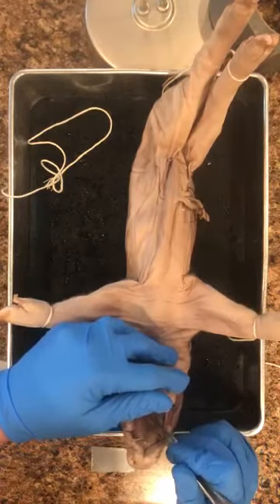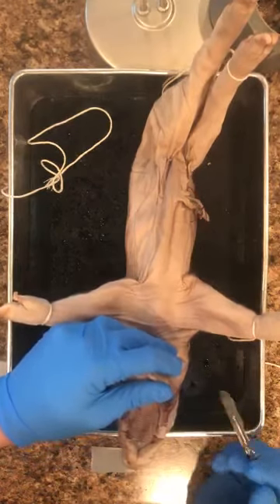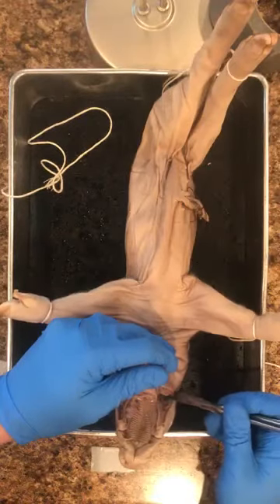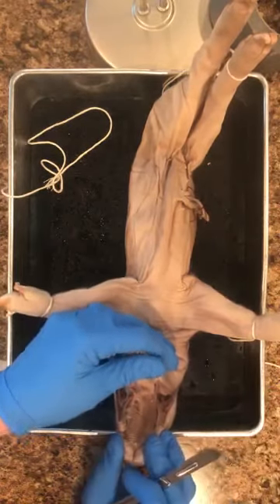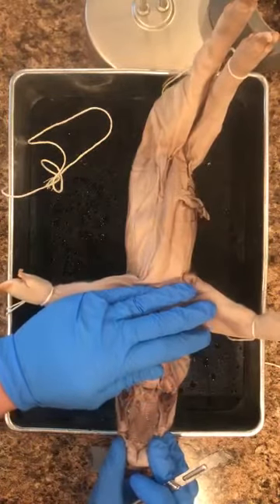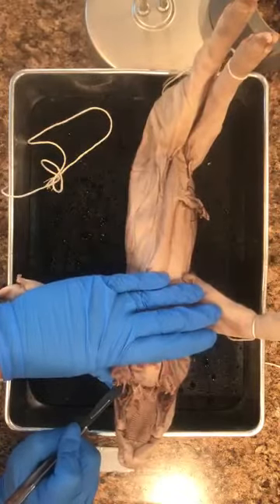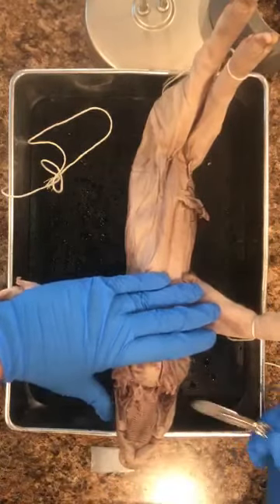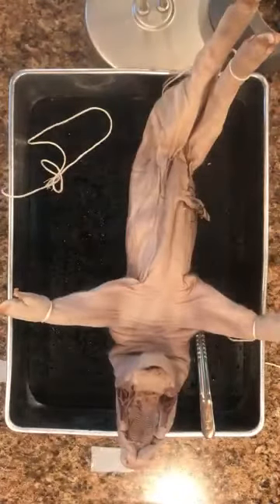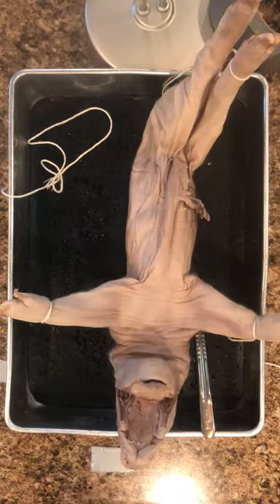I want you to be able to see everything in here. This burger has some sharp teeth. Okay. Awesome. Okay, so cool, guys. There's something I particularly need you to see here. So, I'm gonna get a paper towel and wipe some of this out. It's just like preservatives and stuff, gunk.